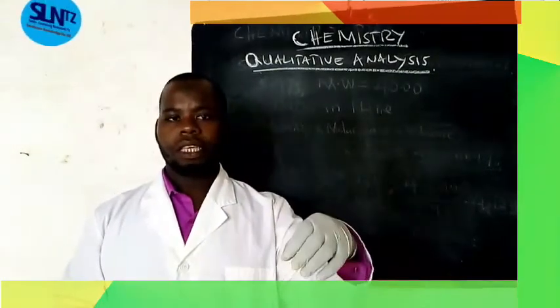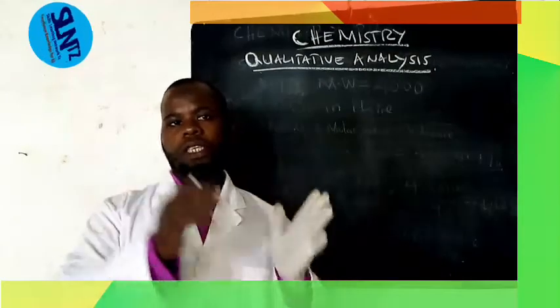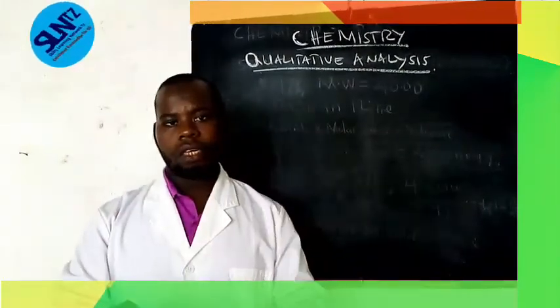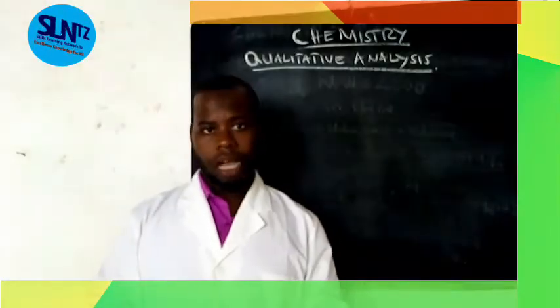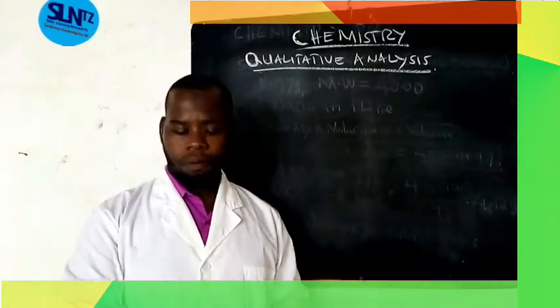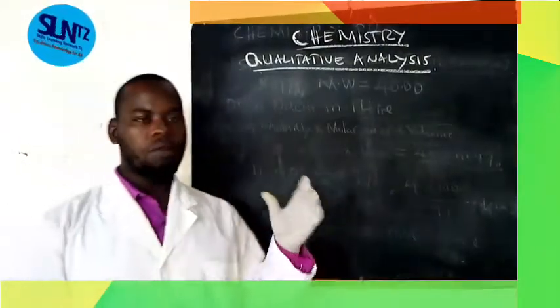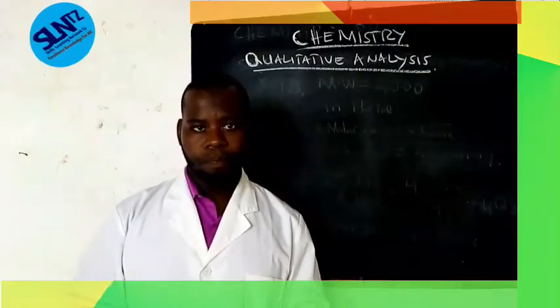But within the first step, preliminary testing, we have almost 7 tests. You can open your sheet and cross-check preliminary testing. We have appearance, flame testing, action of heat, action of dilute hydrochloric acid, action of concentrated sulfuric acid. That is the preliminary testing systematic procedure. But the first, which is very important when you analyze your salt sample, is the appearance of your sample.